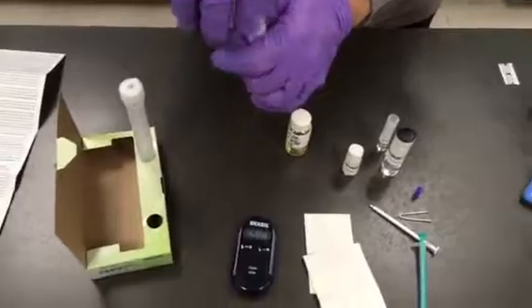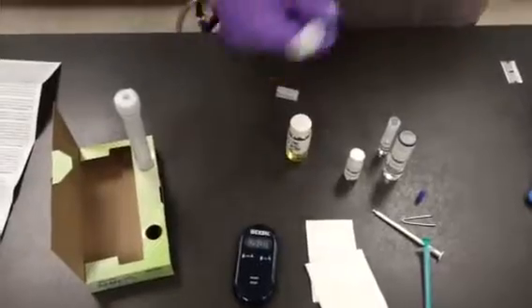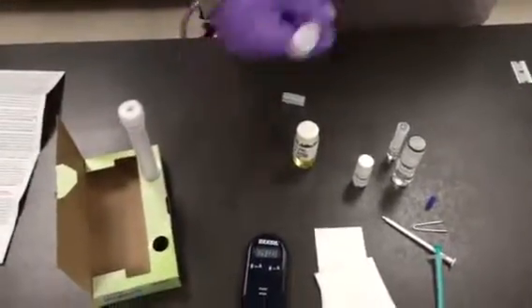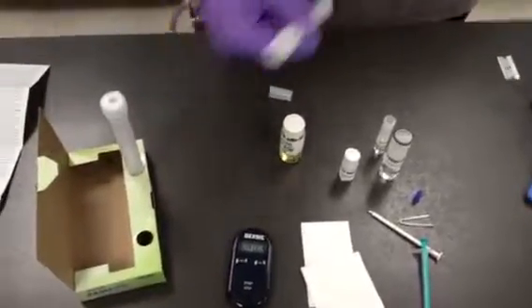Now we're going to cap it and shake it as vigorously as we can for about one minute. It's important that we get everything mixed well — shake it as hard as you can during that minute. It's good to have your nine-minute timer ready to go, whether you're using your phone or a stopwatch, so that when you're done shaking you can time that reaction.